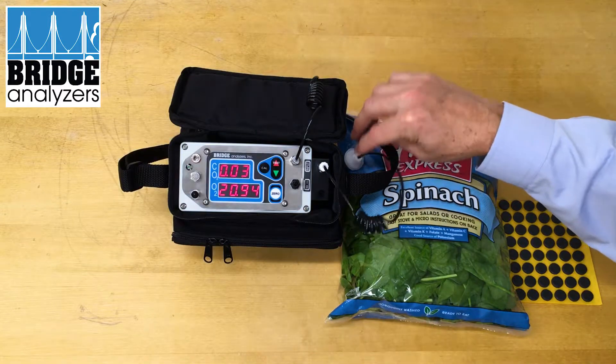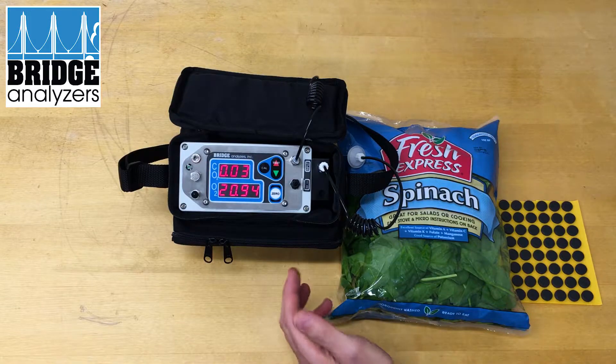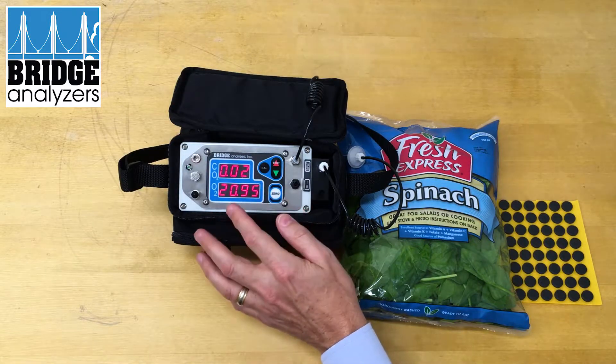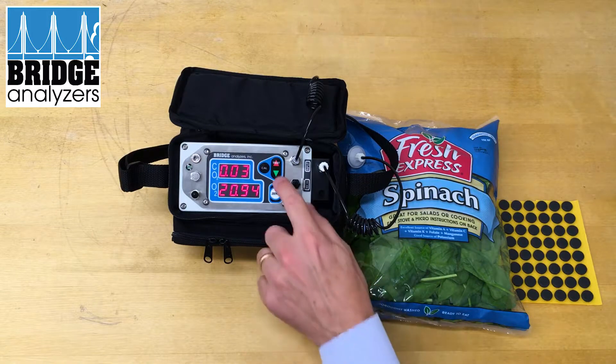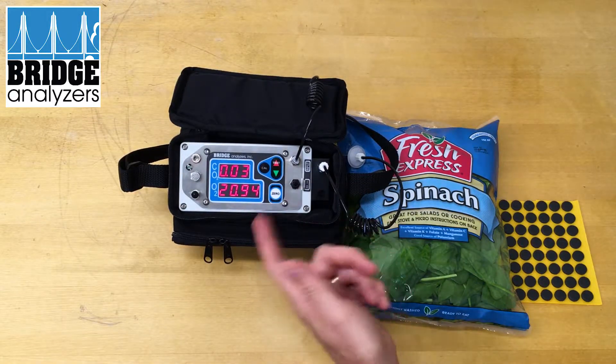In this case, normally you would be in discrete testing mode, but to get it into continuous test mode — when you first turn it on it's in continuous test — but if it's in discrete test mode you press the green arrow key, which we've done, and the pump will be running on a continuous basis.